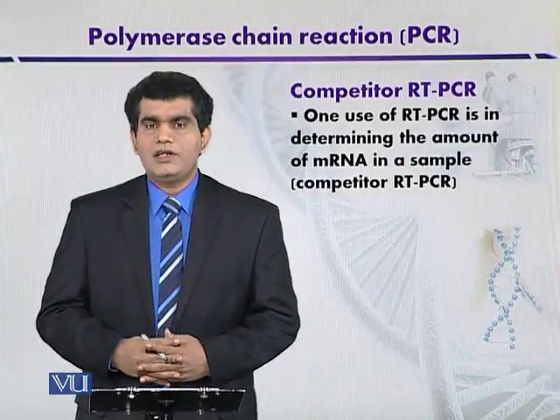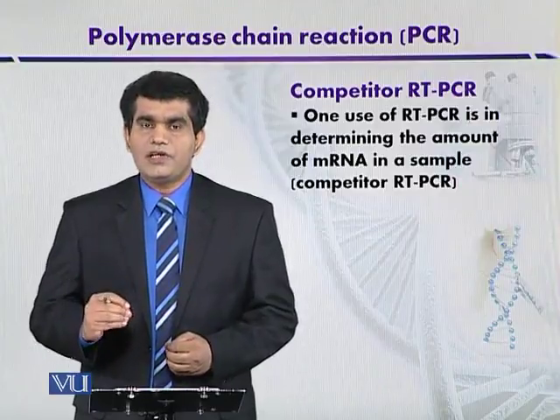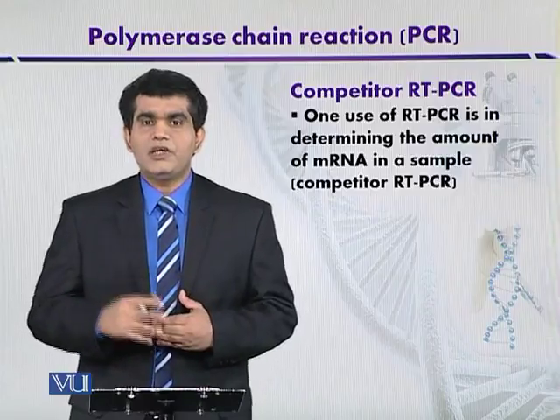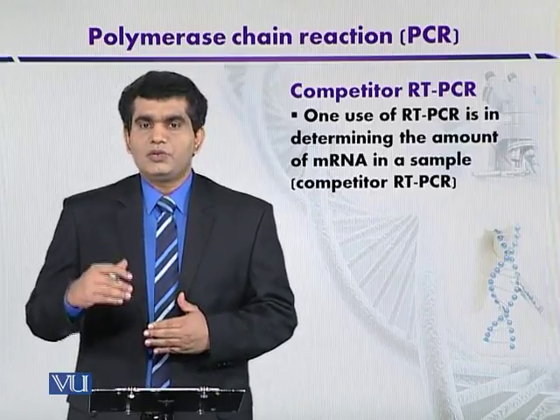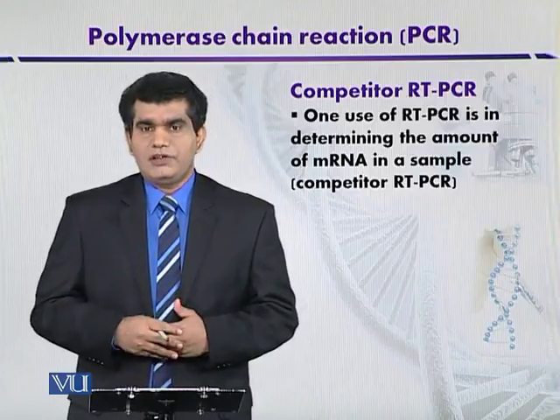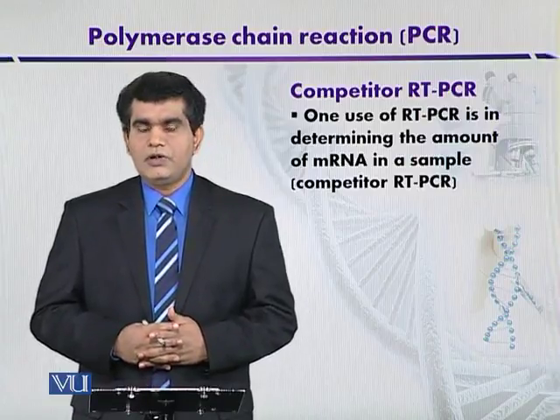Competitor RT-PCR. This is also one of the variants of RT-PCR. अब ये किस मकसद के लिए यूज़ किया जाता है? इसको मेनली यूज़ किया जाता है to quantify the messenger RNA or even the cDNA in the tissues.